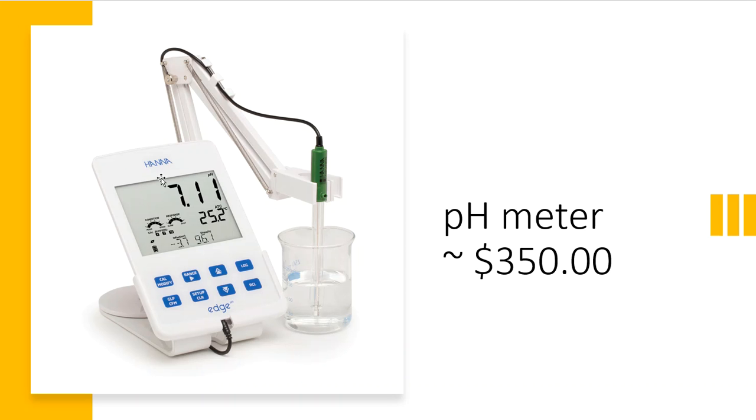On the screen, what you're seeing is the great big number 7.11. That, of course, is the pH value. pH value can change depending on temperature. So that's what you see down below. This is the temperature of the reading as it's happened. So sometimes we have to write down those values just to make sure that nothing funny is going to happen with room temperature in our readouts. All right. So there's one example of a pH meter.